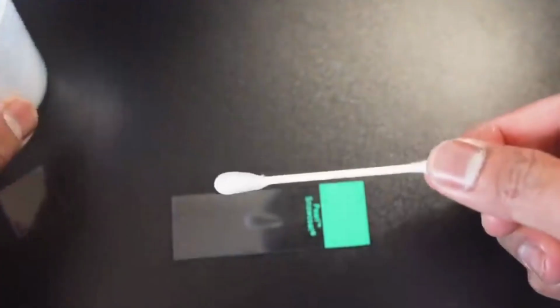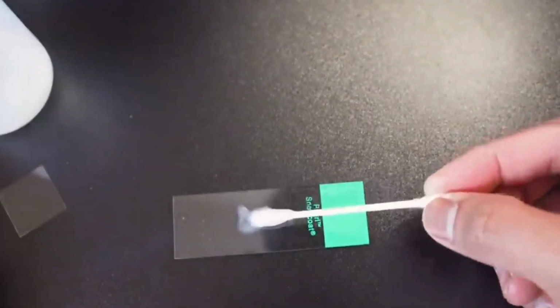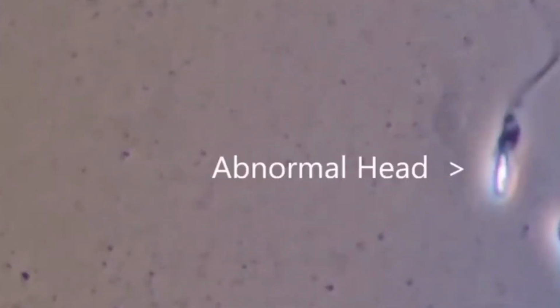All right, let's dive into the video. What is microscopy? Microscopy is the scientific technique of using microscopes to observe and study objects that are too small to be seen with the unaided eye.